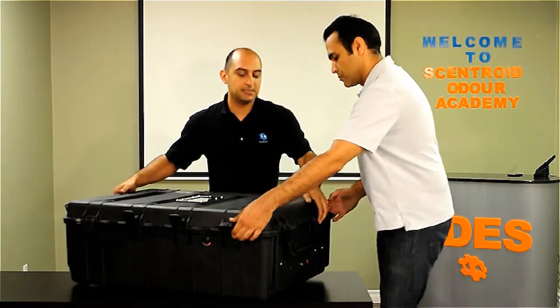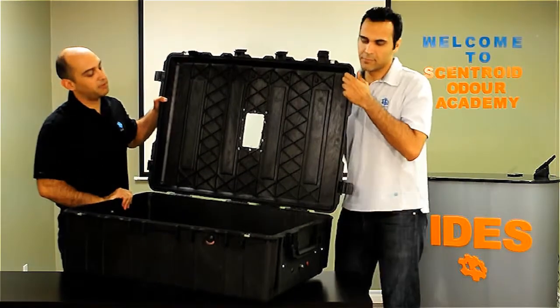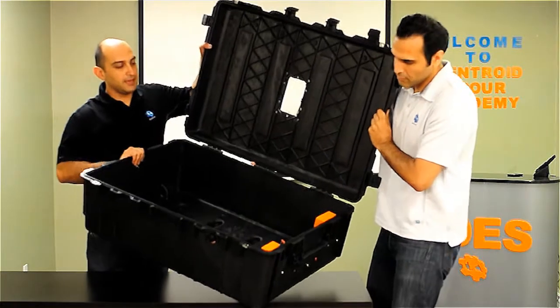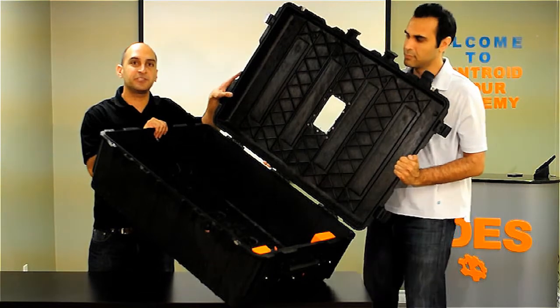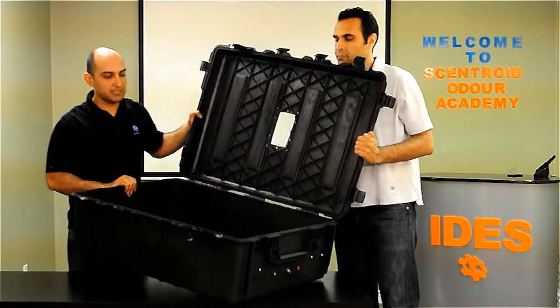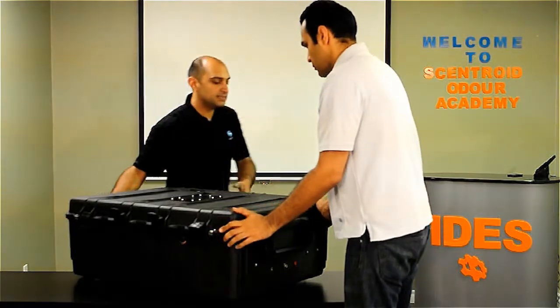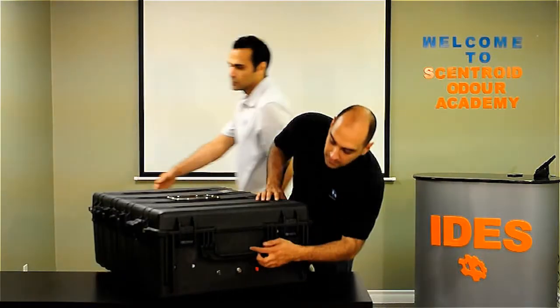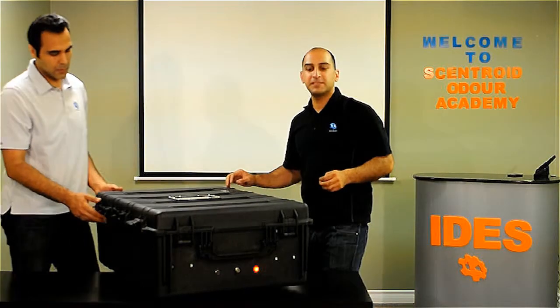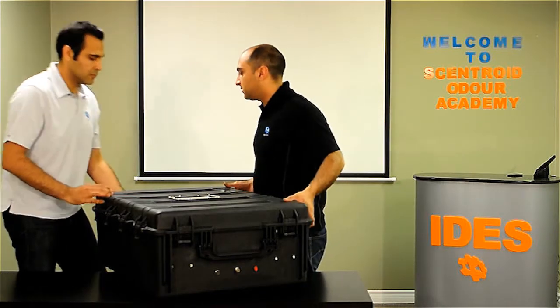It has a pretty big case — it's open already, so the bag goes inside, and we can lift the engine to show you. It has two pumps instead of the single pump of the 10 liter version. Basically it works exactly the same: you put the bag inside, close the case, and lift the switch. The pumps take the air from inside the vacuum chamber, making the bag inflate.